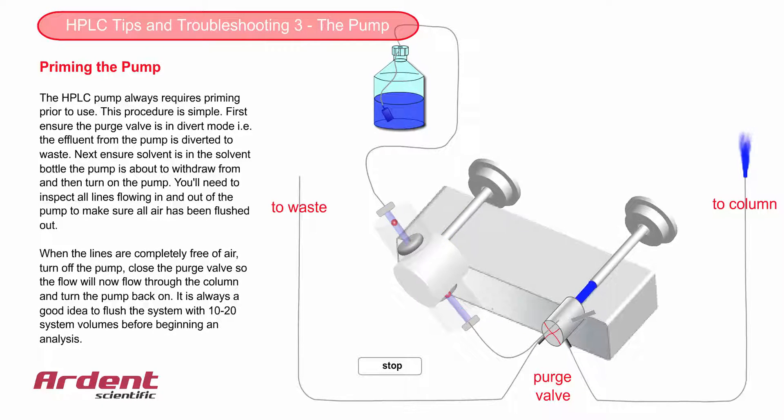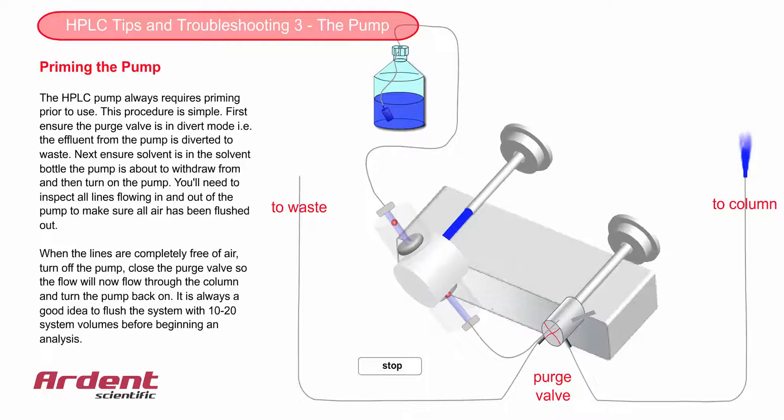If you close the purge valve while the pump is running, this will cause the pressure to change from ambient pressure to possibly several hundred bars instantly, and this could damage the column by causing column voiding.